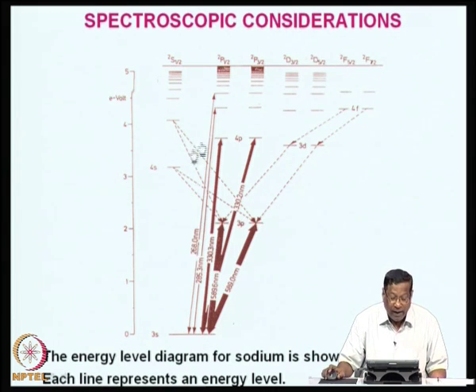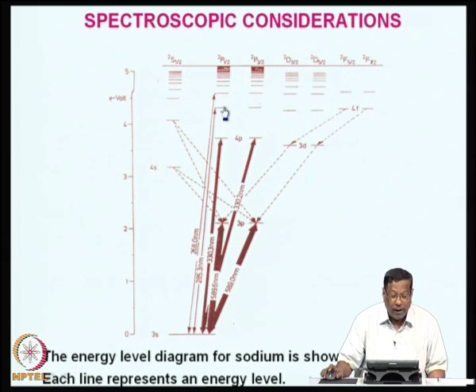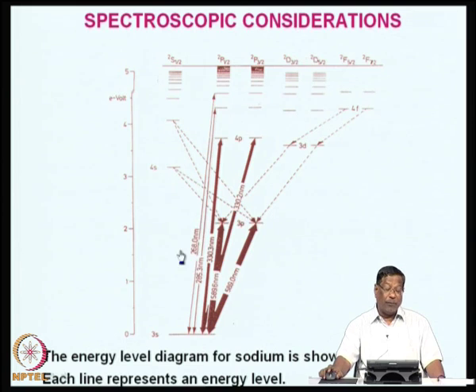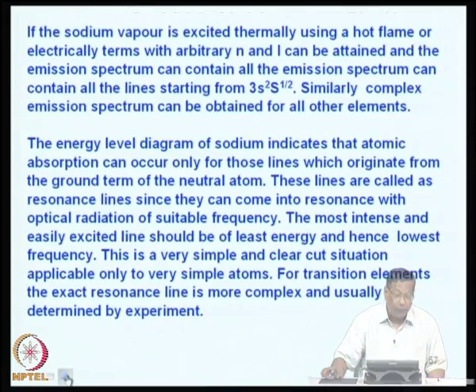So, you can see that a number of possibilities are there for excitation from the ground state. For example, here you can see it goes straight away up to 4.5 volts and then one around 4. Here there is one, here there is one, here there is one. So, a number of excitations are possible for sodium. So, how to identify each of these lines, and how we try to look at identifying these lines and try to understand their spectrum.